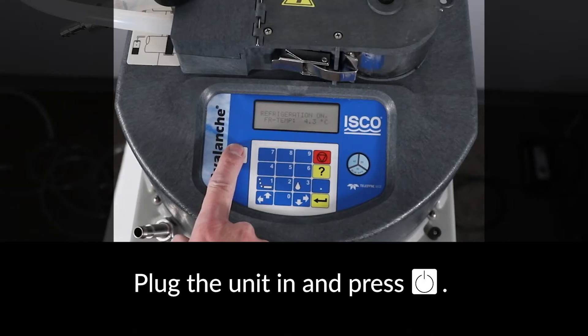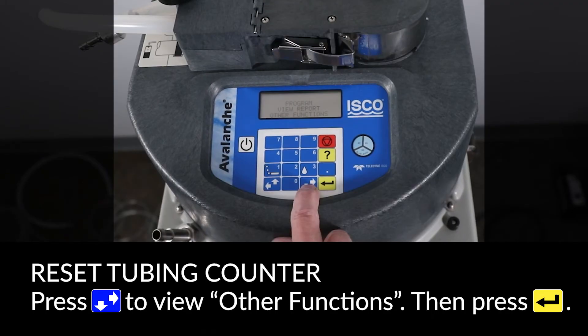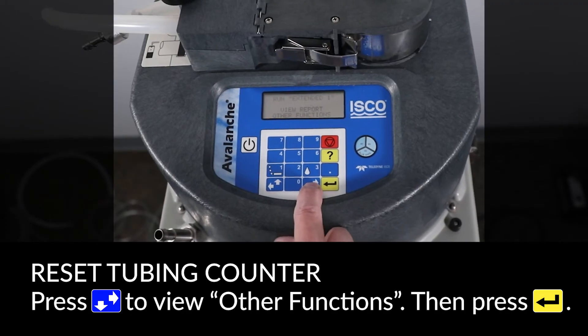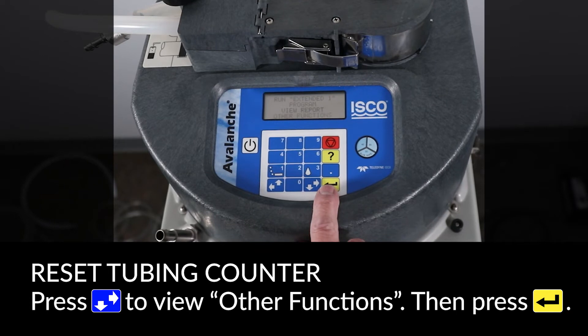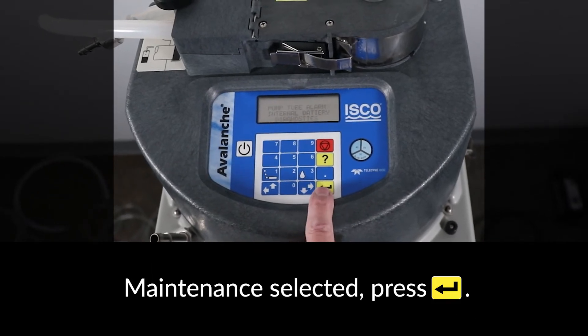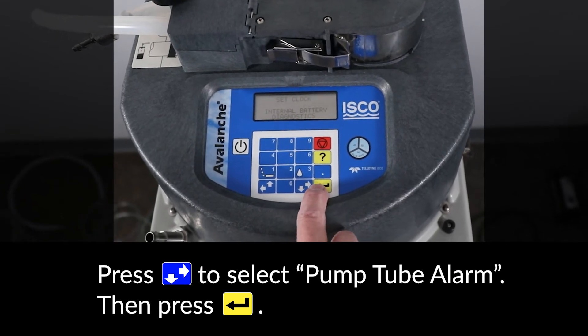Re-apply power and press the white ON key to power up the Avalanche. To reset the tubing counter, press the DOWN arrow key to get other functions blinking and press ENTER. With maintenance selected, press ENTER. Use the arrow keys to select pump tube alarm and press ENTER.